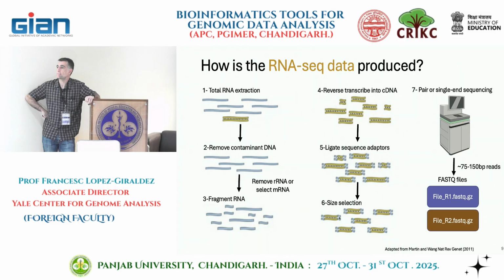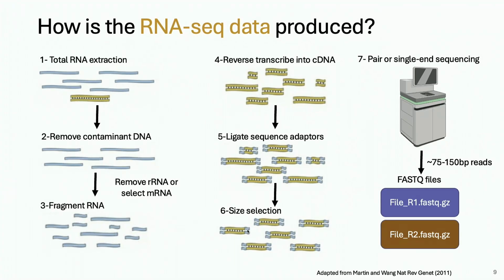So there are two places that you can do fragmentation. Either you can fragment RNA itself, or you can fragment cDNA. So like in the case of this picture, Francis is fragmenting RNA here, but you can also fragment cDNA. Why is this important, or is it important at all? No, it's not epitranscript. It's about just RNA.